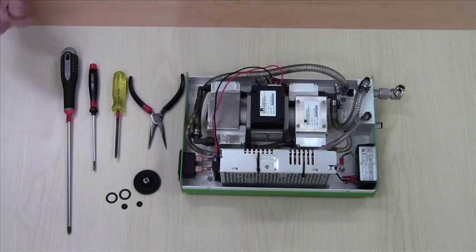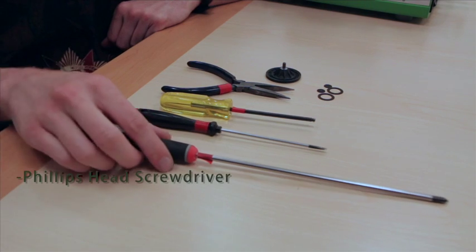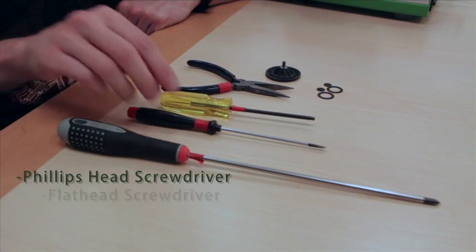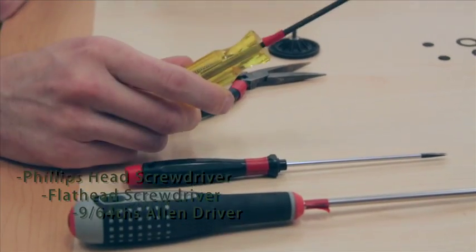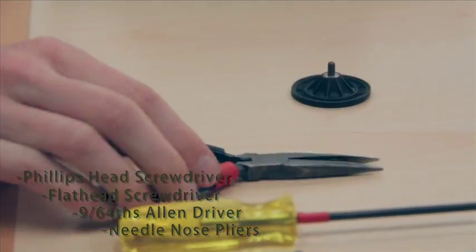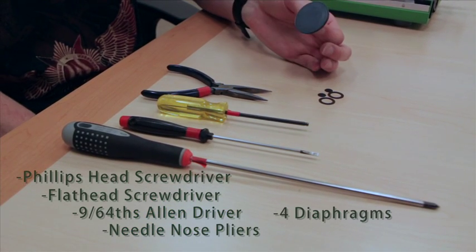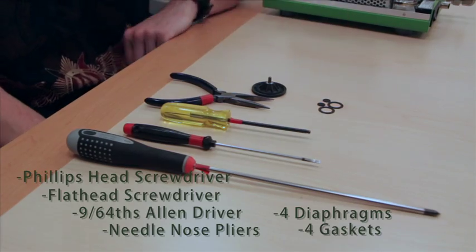This is the generalizer pump diaphragm replacement. We're replacing the diaphragm. The tools required for this job will be a Phillips head screwdriver, a flat head screwdriver, a 9/64 Allen driver, a pair of needle nose pliers, a set of four diaphragms, and four gaskets.